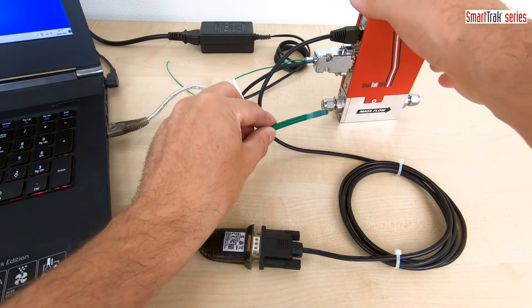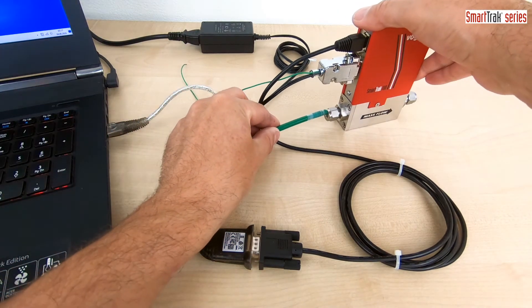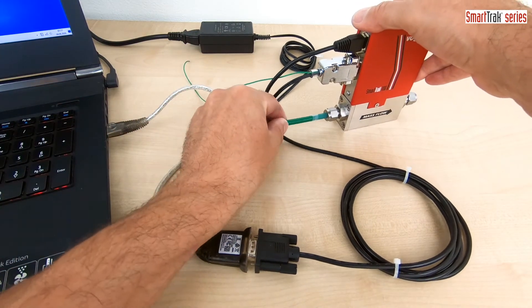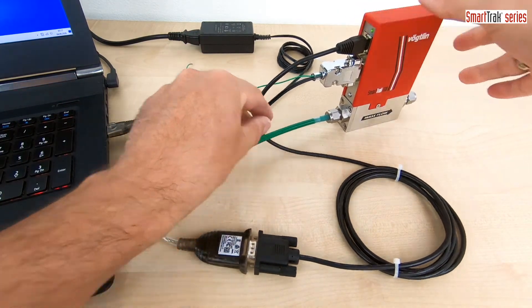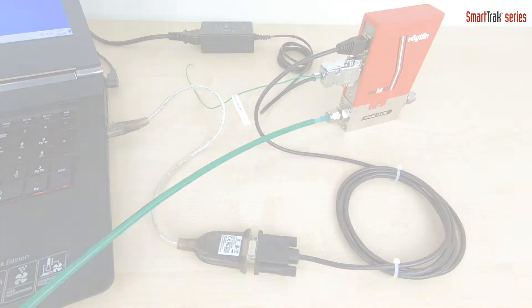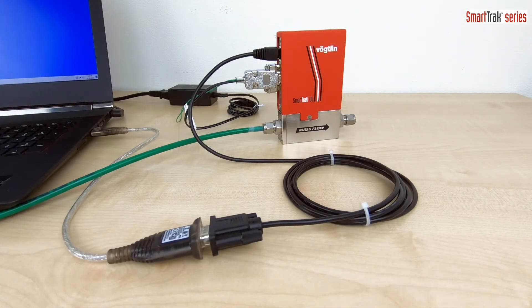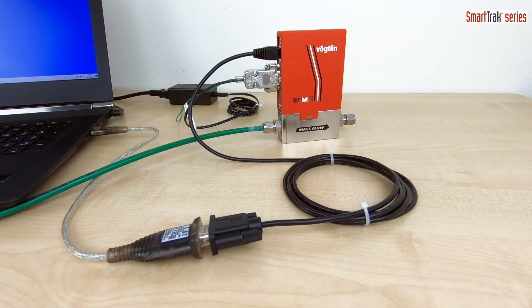Finally, connect your gas hose to the inlet of your SmartTrak device and plug the power supply to the mains to power the unit up.